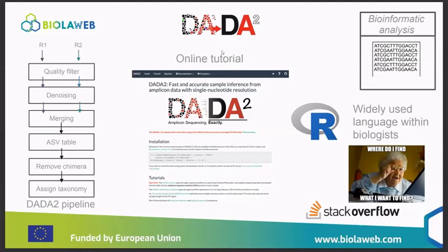What is cool is that you have an online tutorial that explains all the steps for your analysis, all the commands you have to use to analyze your data. And also, as it is using R, it is a widely used language for biologists, and most of the information you are looking for is on the internet, because there is a great community of biologists helping each other.